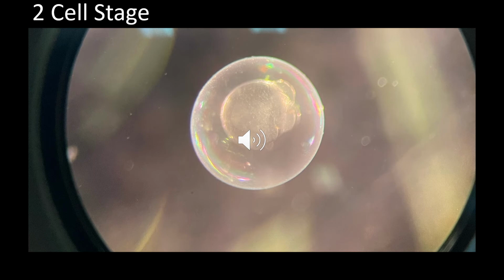This is the zebrafish in the 2-cell stage going to the 4-cell stage. This is approximately 50 minutes to 1 hour post-fertilization. At this point, the individual cells can be clearly observed at the animal pole, while the yolk can be observed at the vegetal pole.